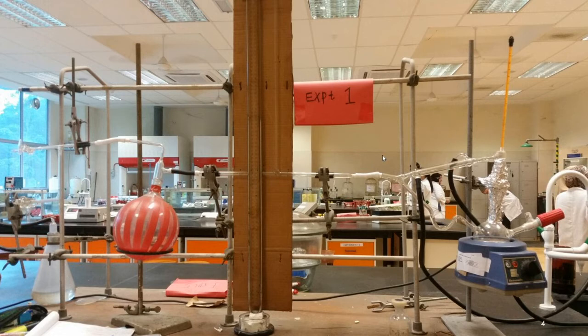So it's not wise to start the experiment at a high pressure, because that involves a high boiling point, and it's not easy to cool down because it takes time. It's better to start at a low pressure and then slowly increase. As you increase the pressure, the system is going to stop boiling.